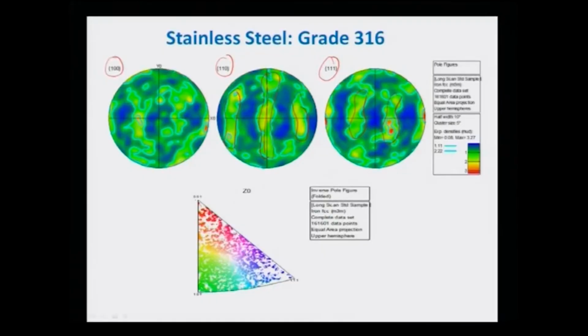In fact, one can do better nowadays with the help of better software. So, what you can see here is the number of grains having different orientations plotted. This is 001, this is 101, this is 111, and you can see that predominantly there are large green areas present here. So, therefore, the grains are predominantly 101, which I just showed you.